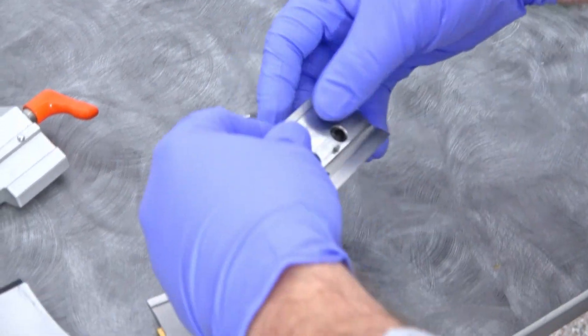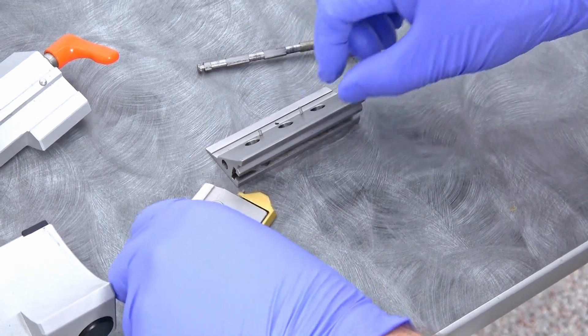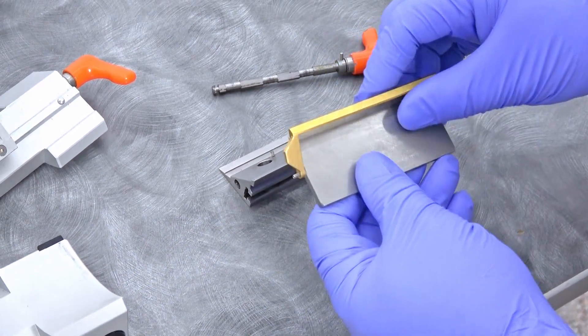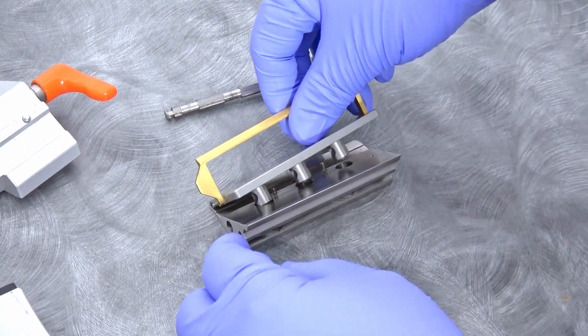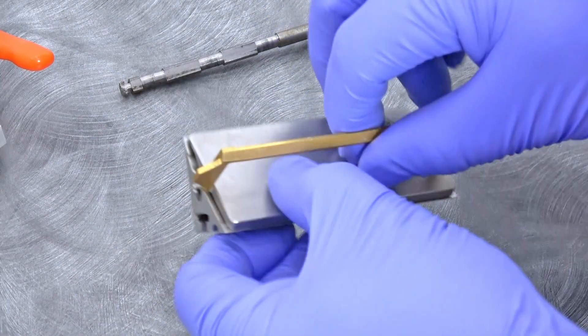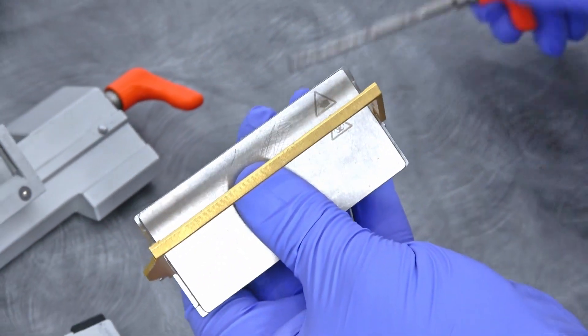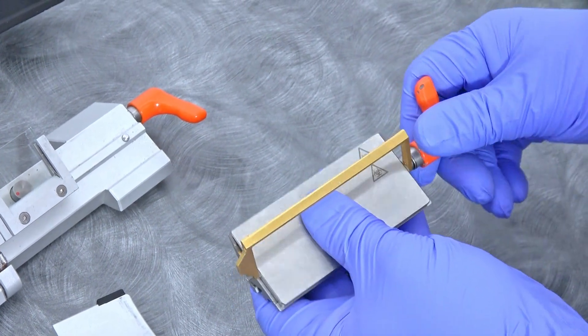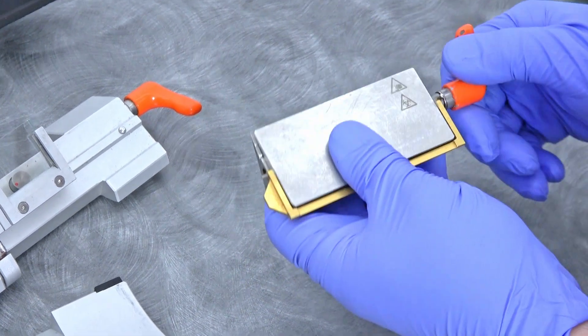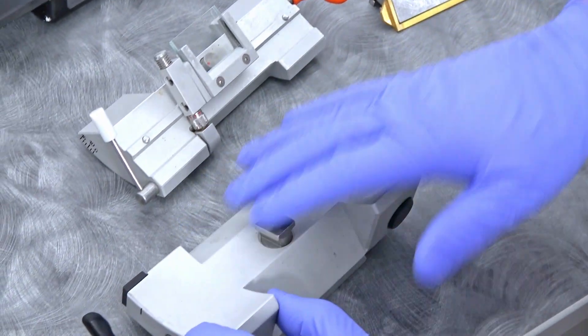We're going to start putting this back together again. It goes pretty much right back the way we took it apart. You can just put that right back in there. Then you've got to hold it down, hold the spring shut so you can just push your pin back in. That just wedges that again.